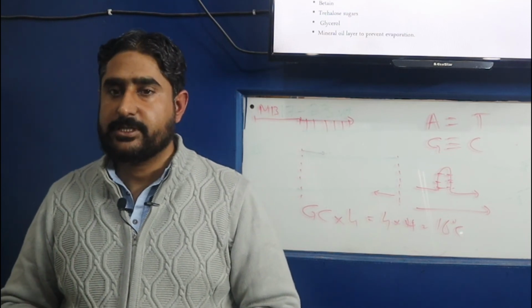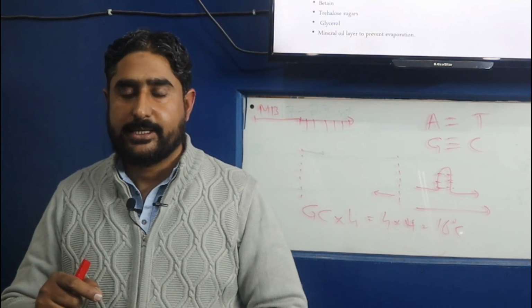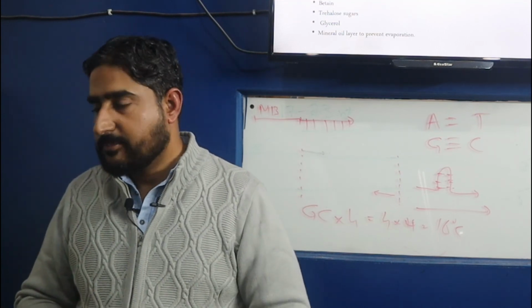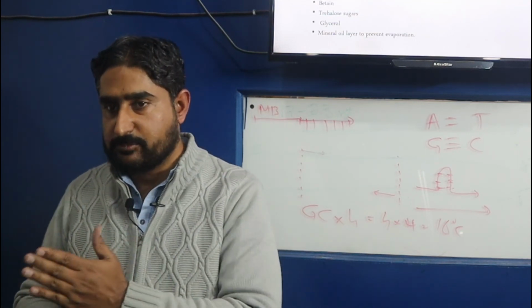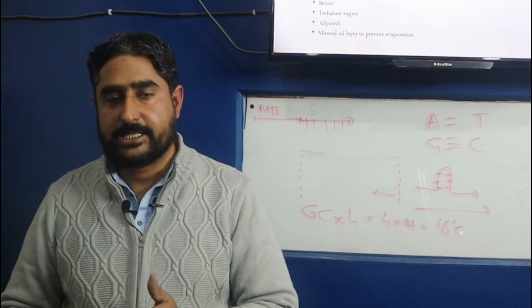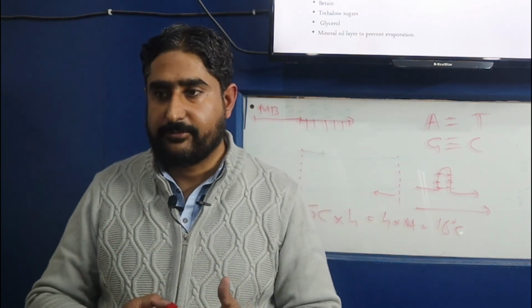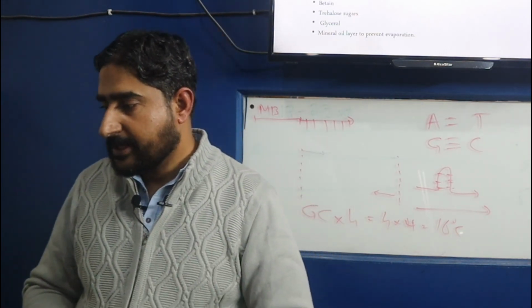There are times when just making a dilution of the template DNA is sufficient for the success of the PCR reaction, but you might need to run the PCRs in gradient mode. For example, in one reaction you pick up the best annealing temperature, which you can use in your successive reactions.